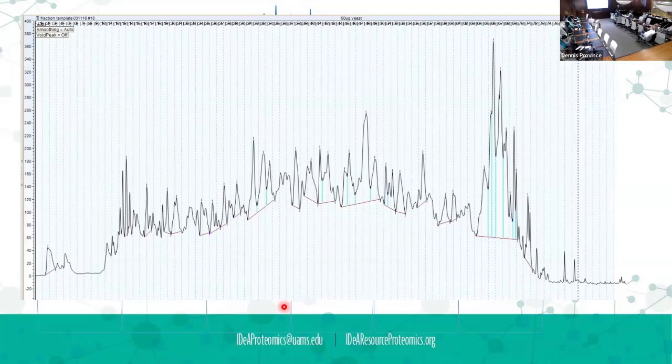This is an example of a chromatogram. And I think my lines are cut off at the bottom. So typically what we'll do is we'll take a fraction and combine. I think this one was designed when we were doing 12 super fractions. So we were taking a fraction here, 12 fractions later, we're taking that fraction. We were combining all of those into one mixture and then running that on the mass spectrometer. That way it looks like the complexity of a lysate every time we run it. The mass spectrometer has hydrophilic peptides, hydrophobic peptides, and peptides in the middle. It's just not all the same peptides.